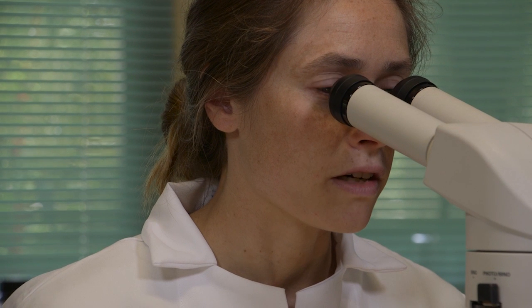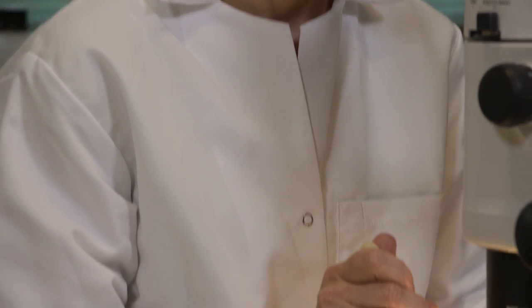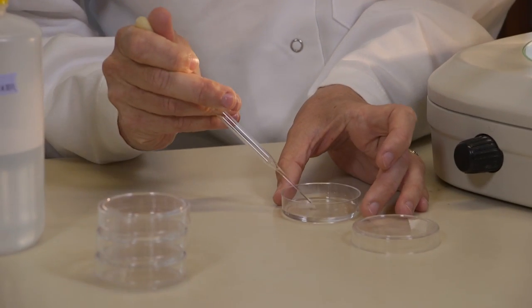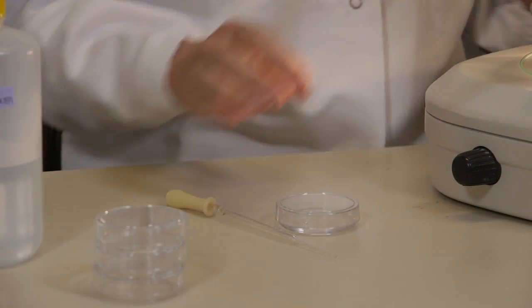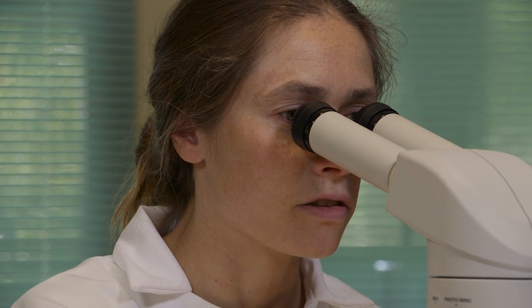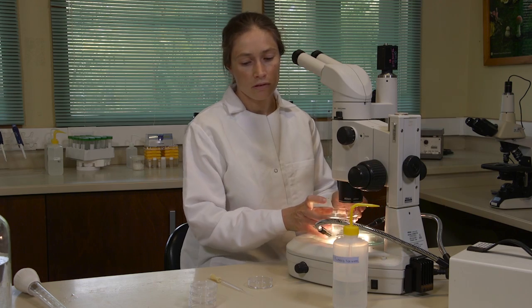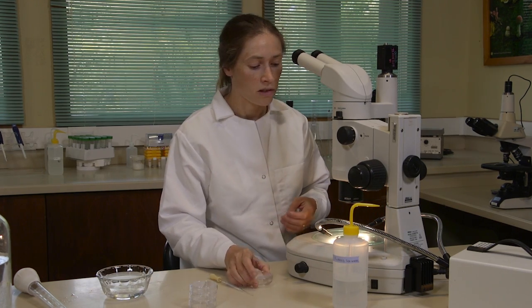Once you find your larvae, use a glass pipette and separate it into a small dish with filtered sea water. Keep sorting the sample, separating interesting specimens, until you're done with it. Once you've finished sorting your sample, you're ready to look at some of your selected specimens.